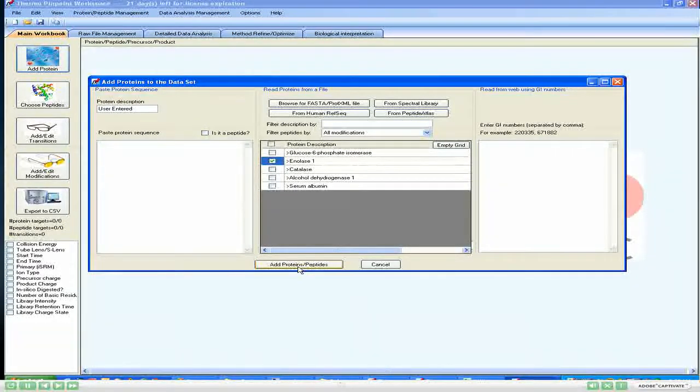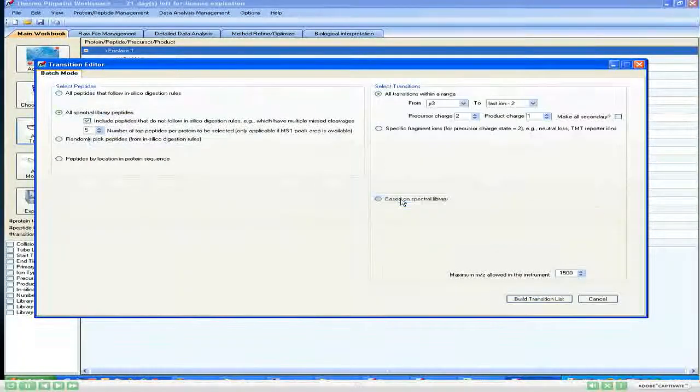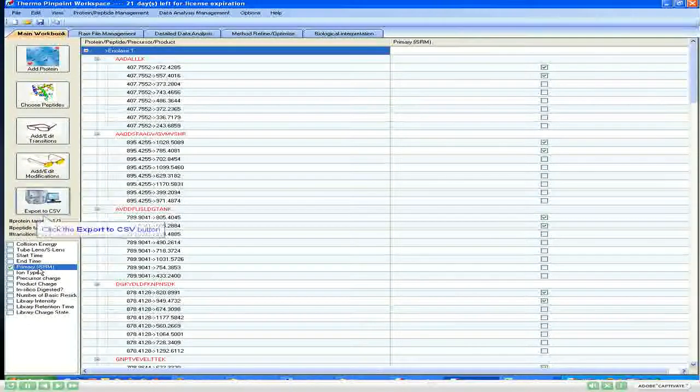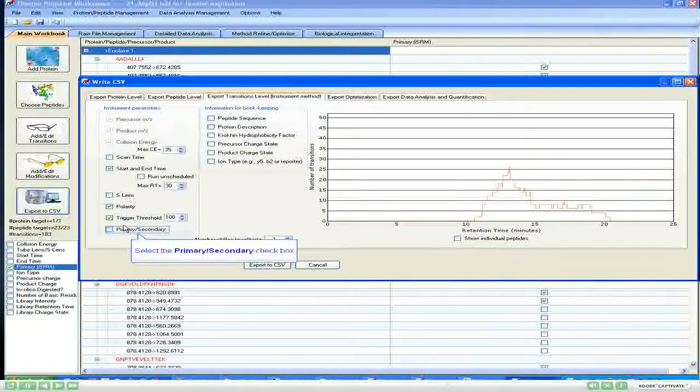And how is an iSRM method built? I'll just give a very quick overview. You need TSQ 2.2 software to generate an iSRM file, and in that you would have a new method called iSRM here. And once you go to iSRM, you'd have these two additional categories called trigger and reaction category. And this is where you can specify what transition is going to be primary and secondary. And your trigger is the threshold where the primaries are triggered to generate the secondaries.